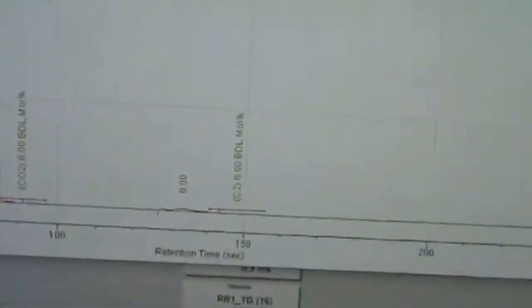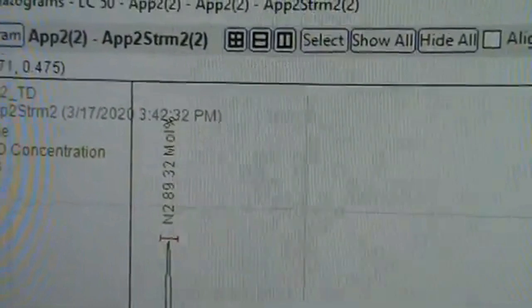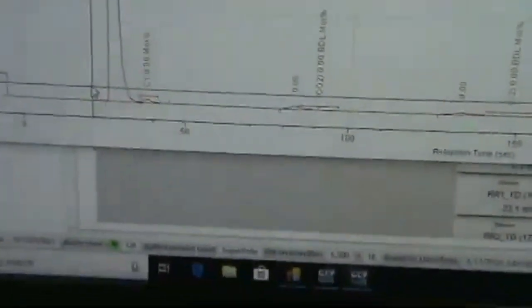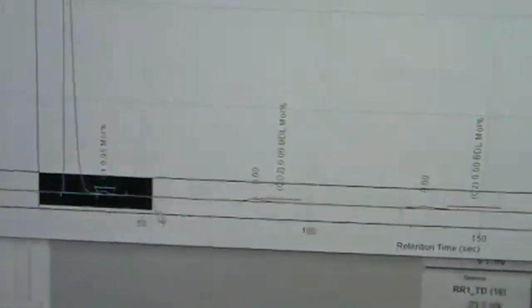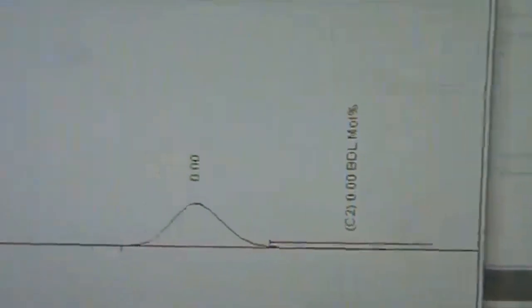So let's take a look. Blow up the main detector. Okay, so there's our bogeys. There's my bogey. Nitrogen, she is sitting real pretty in her window. All right, let's get down here. Right click. And there are our peaks. You, methane, hanging tight exactly where you need to be. You, CO2, are missing. And you, ethane, are missing.